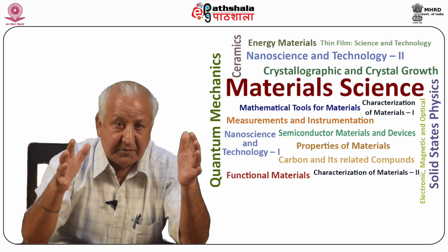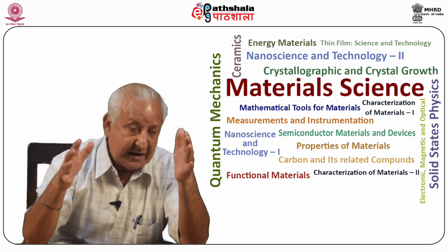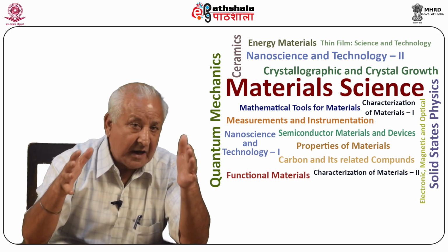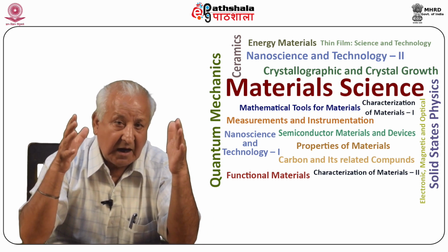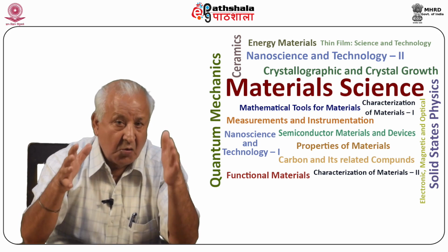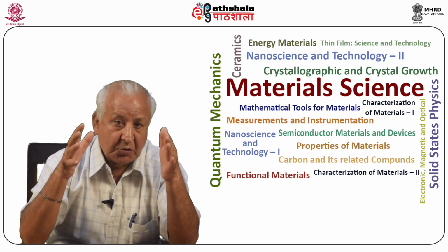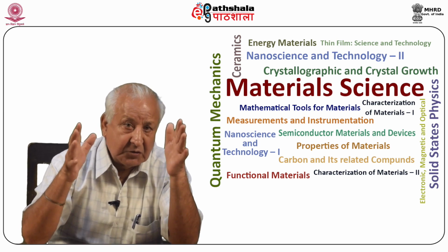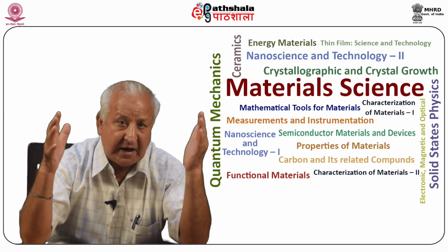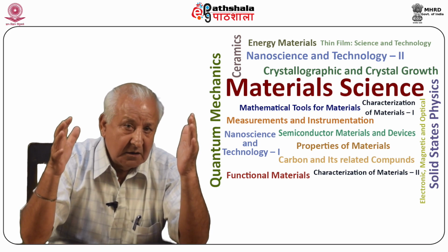This can be achieved by using a single test tube as crystallizer, in which one of the reactants is incorporated in the gel, known as the lower reactant, and the other reactant is poured over the crystallizer, known as the upper reactant, so as to allow its diffusion through the gel matrix. The two reactants are allowed to react by diffusion into an essentially inactive or non-reactive gel.